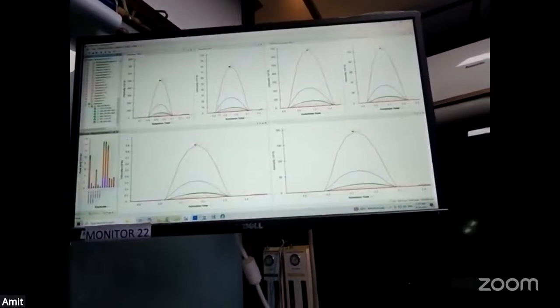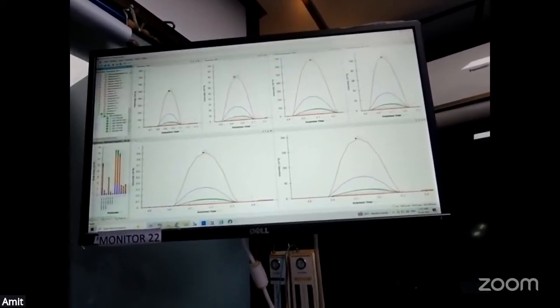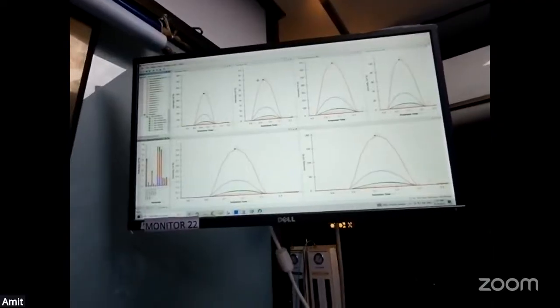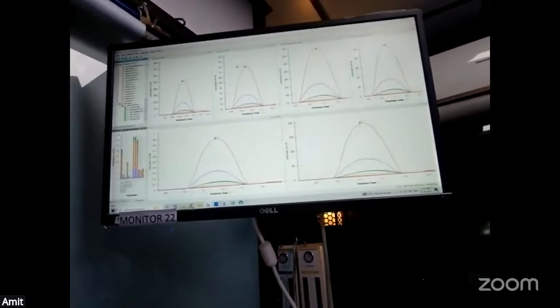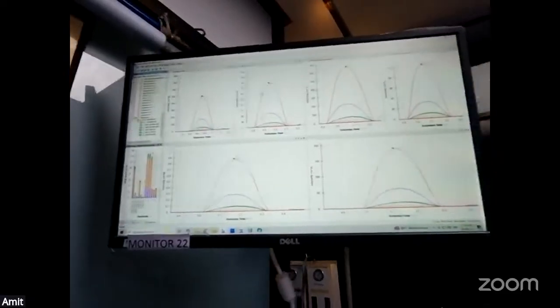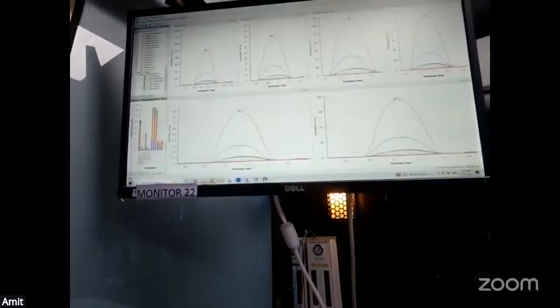So now after the data acquisition, you will get this type of graph where you can see the retention time. At 5.2 minutes, this is coupled to a C18 column, where hydrophobicity is used with different solvent systems, and it has eluted out and we got the peptide.